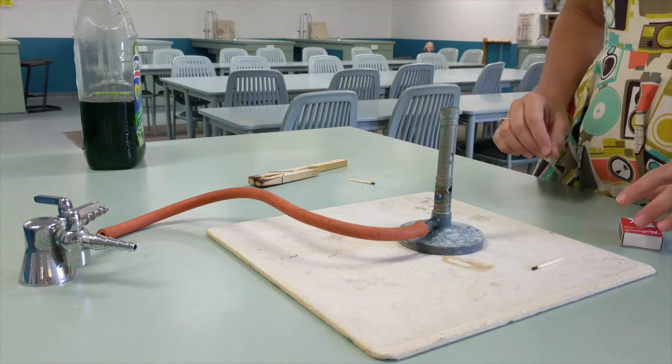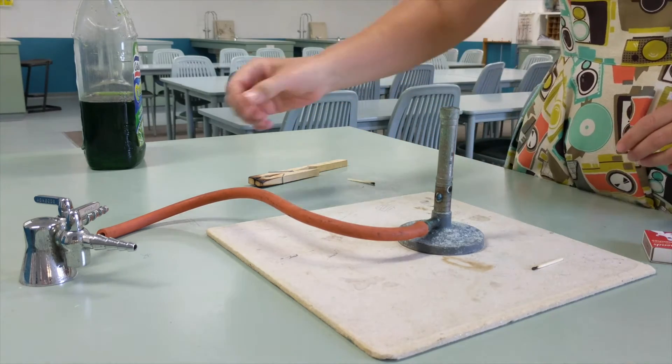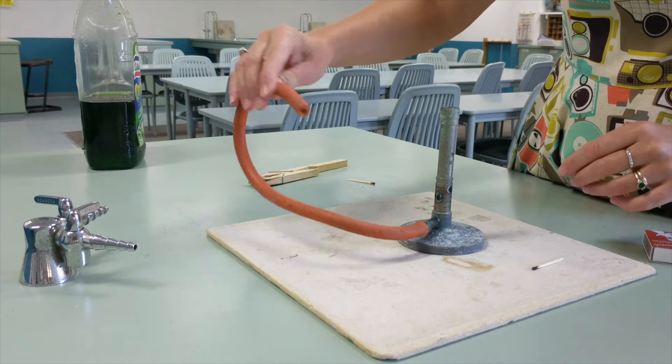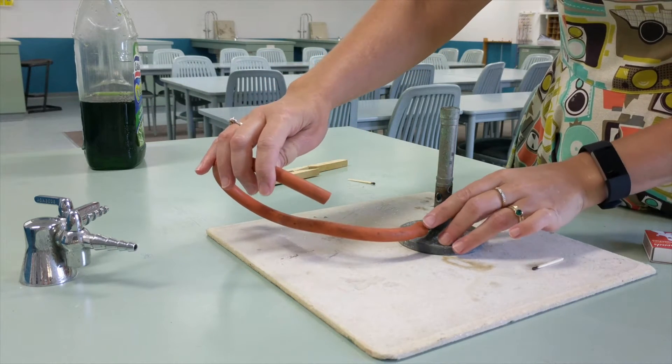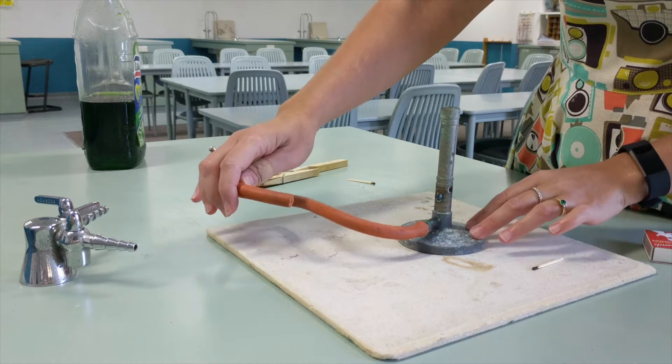I'm going to show you how to light a Bunsen burner. The first thing you need to do is check that there's no damage on the rubber hose. If there's any sign of wear or tear or little holes or perishing, let your teacher know now.